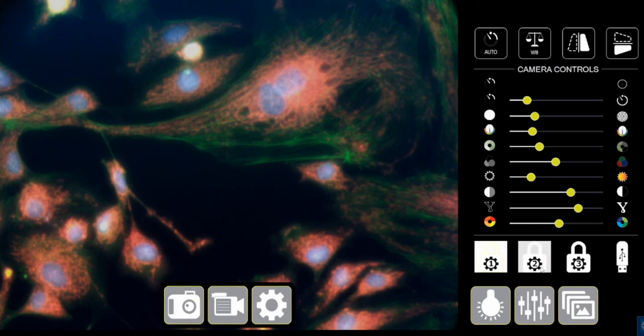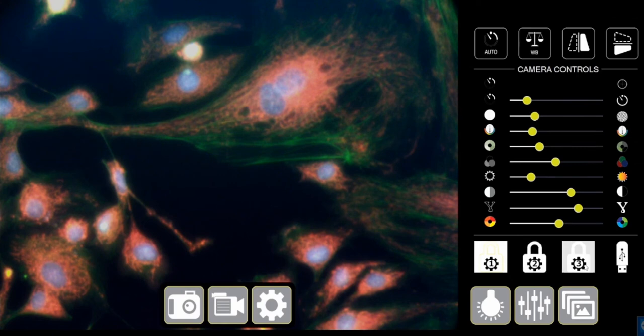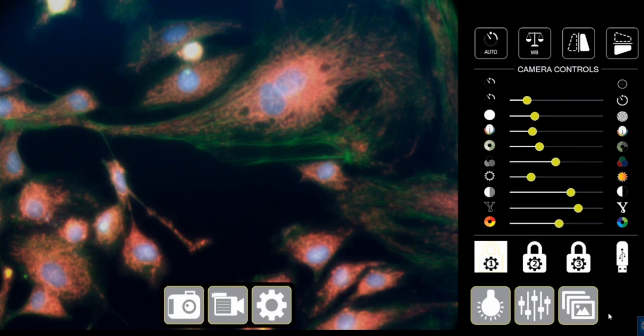So this comes in handy, basically, when you have multiple users or multiple samples that you're working with. You can preset the settings using the lock function here. And then, even you turn it off and turn it on again, you have the settings done.